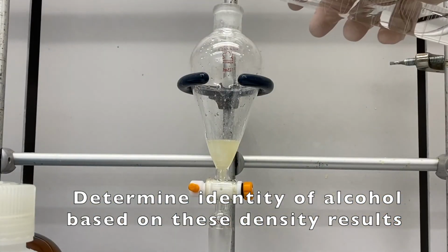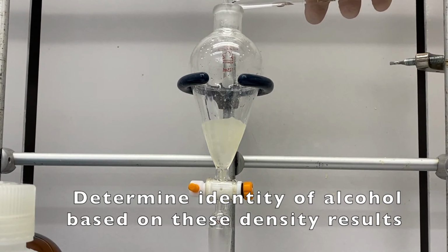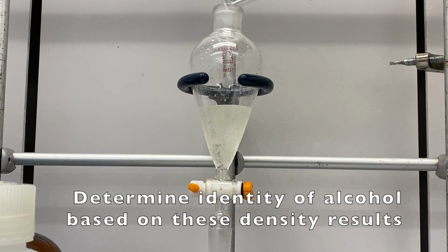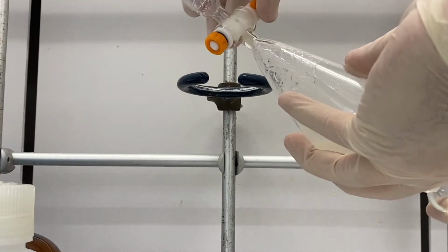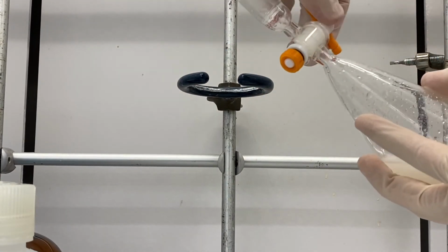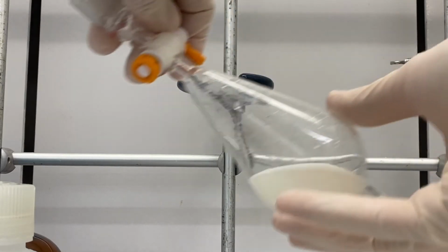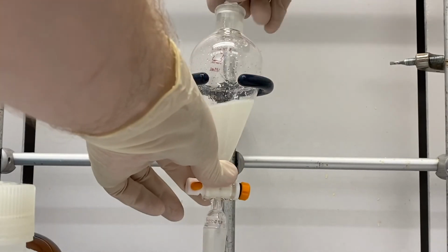So I'm going to add the sodium bicarbonate. And again, I'm going to cap it. I'm going to flip it over and immediately vent it. You can kind of hear a little bit of gas escape, hopefully. There you go. You can see some bubbles happening there. We're going to flip this over. Again, let this sit.